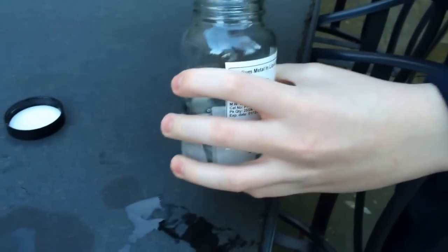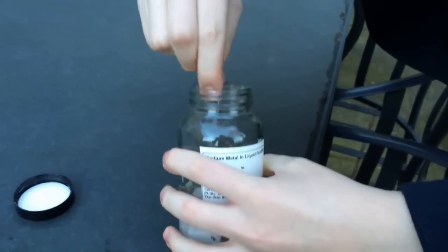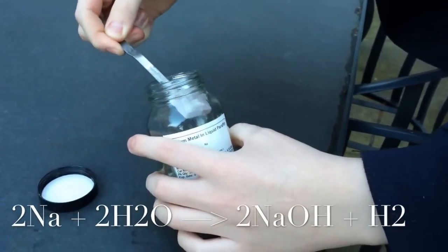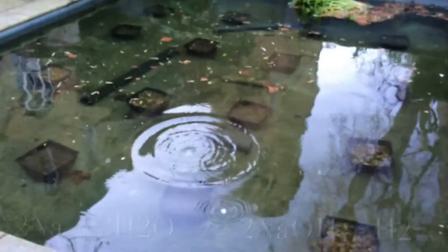Now let's step up. Next, we have sodium. Sodium is a little bit more interesting. It fizzes with a bit more vigor, as you can see.